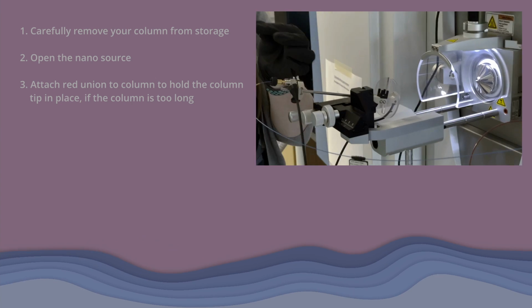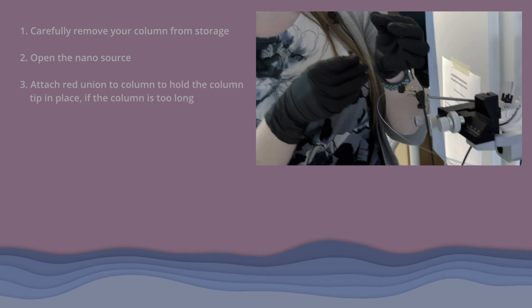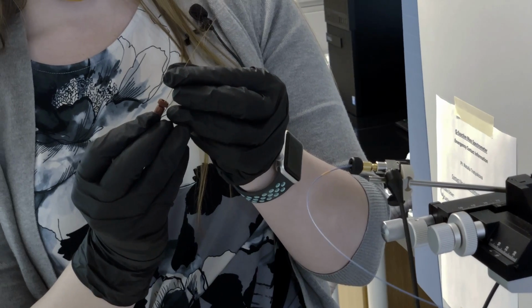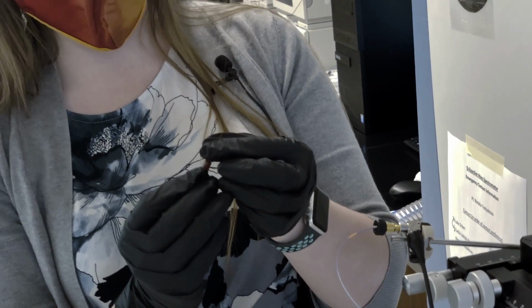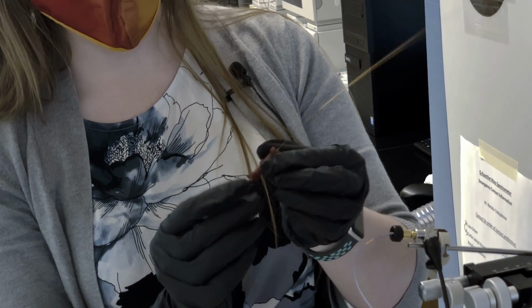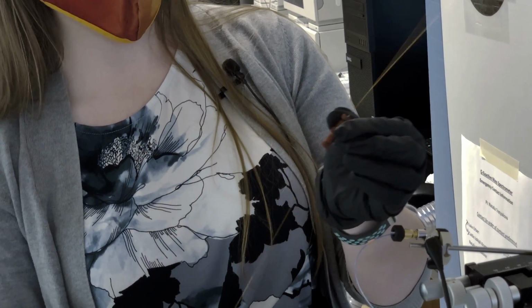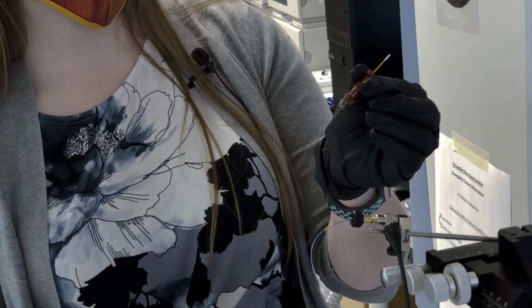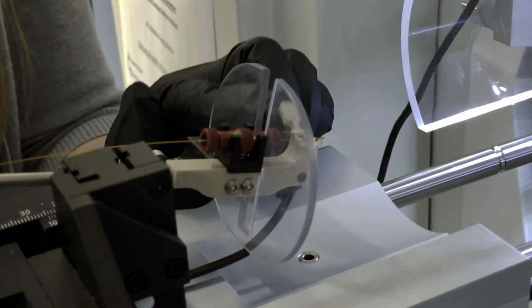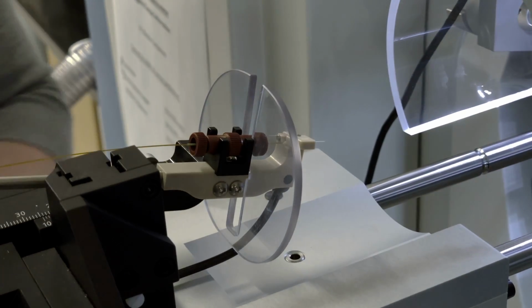This red union goes on close to the tip of your column to hold the tip of it steady. So very carefully insert the end of your column into the union and pull it through. This then sits here to hold the column steady, and that's closed over the top of it.